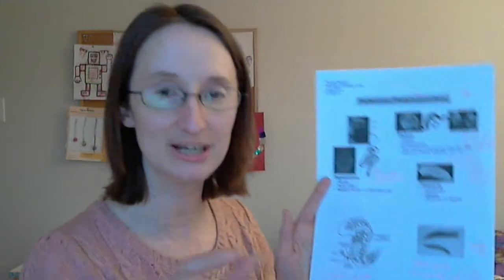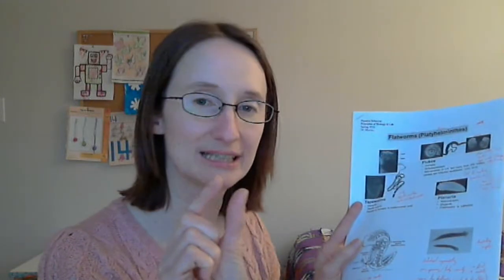Okay, so at the bottom is just some basic background on planaria. They're really small. Again, there's no scale bar on the picture there, but small, I'd say like 1 to 2 centimeters. So very small little worms. You're welcome to look at them under the dissecting scope to see their details up close. They do have bilateral symmetry.